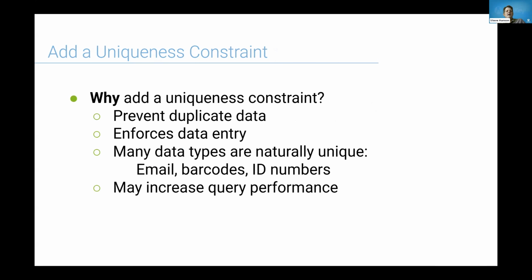Why would you want to do that? Well, in cases where you want to prevent duplicate data in your field, but it can also help enforce data entry from users. It kind of limits what they can put in the field. A lot of data types are just naturally unique and call for this kind of configuration, for example email, barcodes, ID numbers, those kinds of things. As a side benefit, it might also increase performance on your table and on some queries. And I'll get into why that is later.